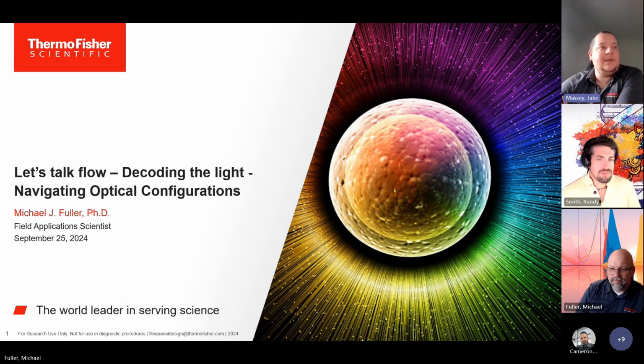Today's topic, we're going to be discussing navigating the optical configurations of your instruments. We have our presenter today, Michael Fuller, who's one of our field application scientists that covers the Southeast region. The talk today, we're going to walk through your optical configurations, how light travels inside of a flow cytometer, and why it's important for your experimental design.